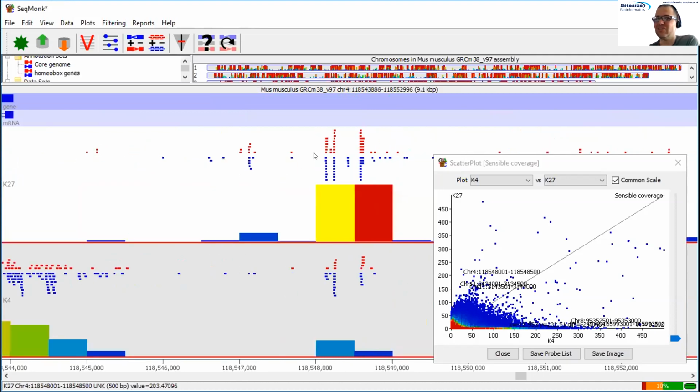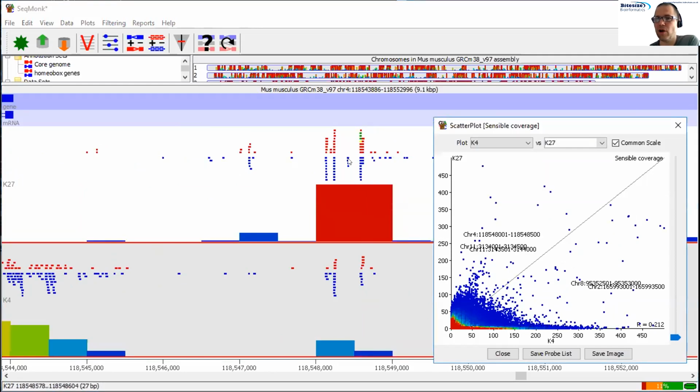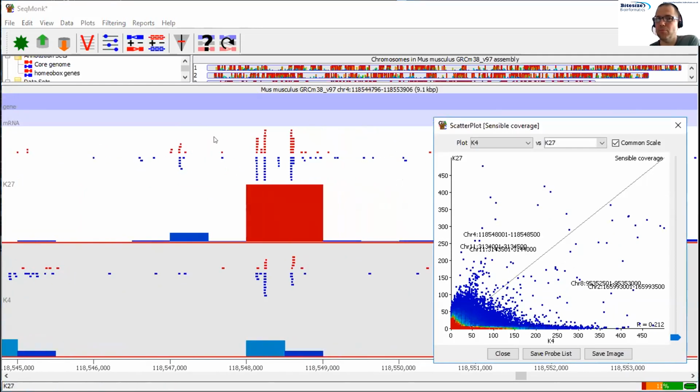But it doesn't look right. So again, this will be really hard to identify if you were doing this in a pipeline methodology, but in a graphical environment, it's really easy to see that although the numbers say that this is different, something can't be right here. Okay, so those are the sorts of things that we can look at in here.